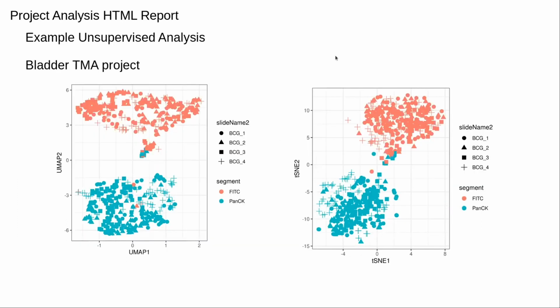And then we do some unsupervised analysis where we can see if the gene expression data segregates the variables that are of interest in the project.